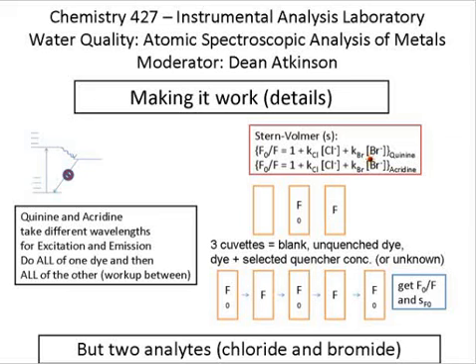So if you think about it, there are a number of different sources of error. We'll assume that 1 is 1 and that therefore there's no source of error in 1. But F naught over F for each of the unknown samples is subject to some error. So when you measure the unknowns, you'll get a value of the S of F naught for the F naught value. I would recommend that you assume that same value of S for the S. And so there's actually 2 contributors to the uncertainty in the F naught over F. There's the uncertainty in F naught. There's the uncertainty in F. There are 2 sets of those that you need to calculate uncertainties for.